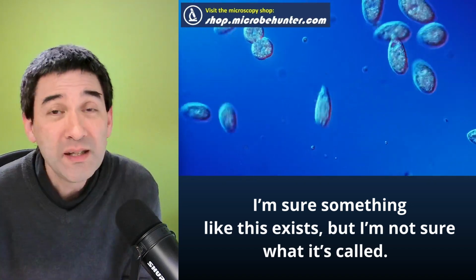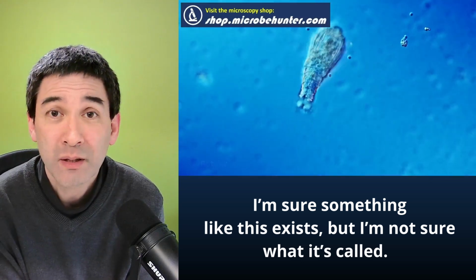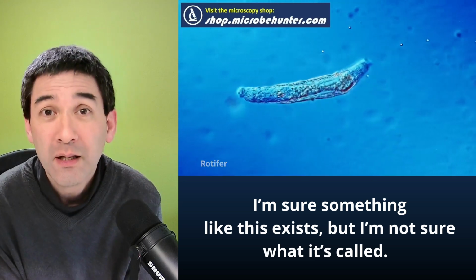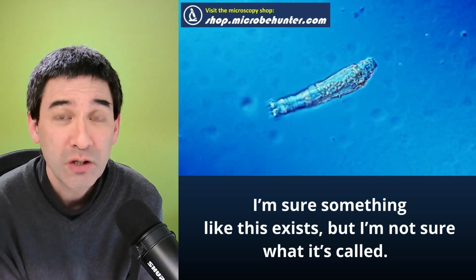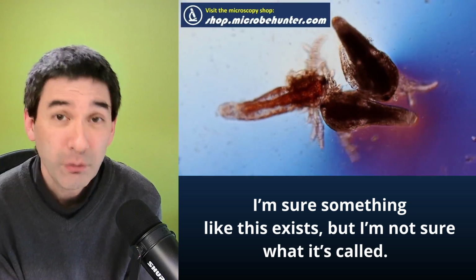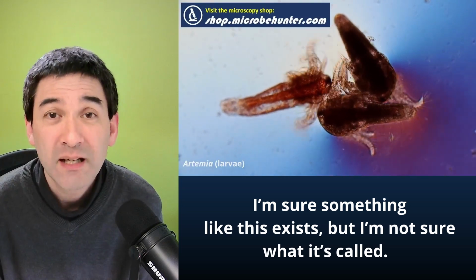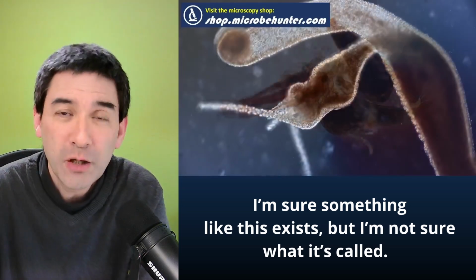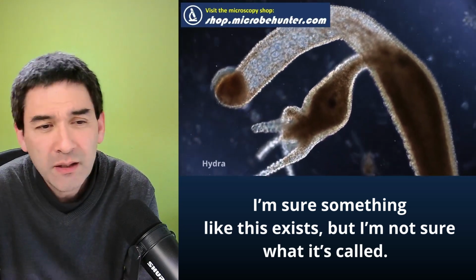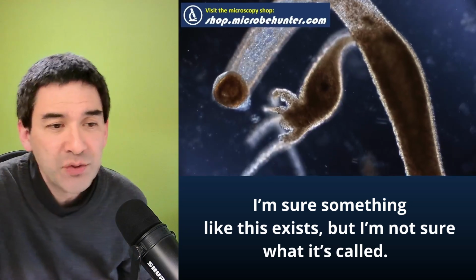So I do not really see a purpose here, but maybe there are indeed some specimens out there that you would like to observe that are very oxygen sensitive. In this case, what I can imagine is that you might have to seal the specimen in a microscope slide without oxygen being able to reach it, right? But this protects the specimen, and there's still, of course, air between the objective and the slide. So, in other words, I do not see a big interference of the outside air.